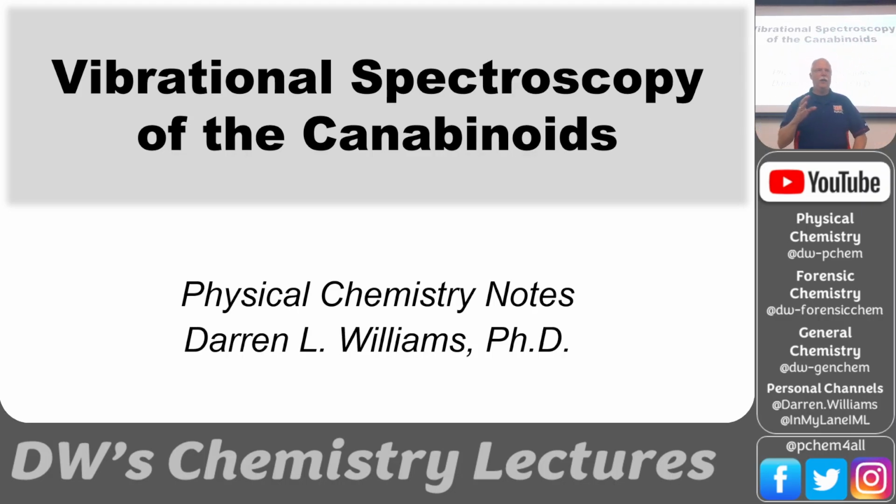This is not like a polished lecture, because this is still a work in progress. This is some of the spectra that we're analyzing for a paper that I'm writing with Geraldine Monjardet in Forensic Science. I haven't got all of these spectra fully assigned, all the peaks, because it's 150, 160 vibrational modes, and they're all overlapped.